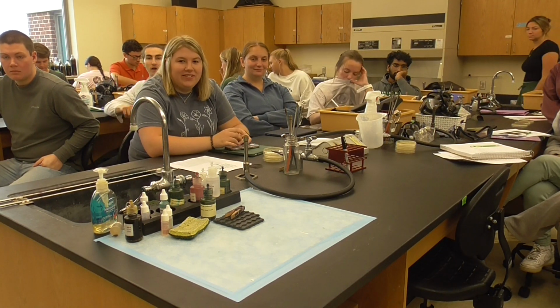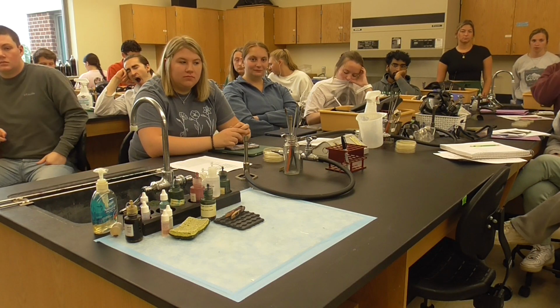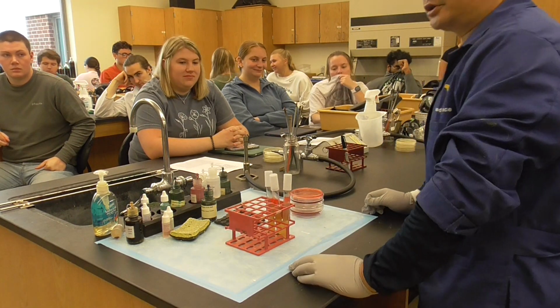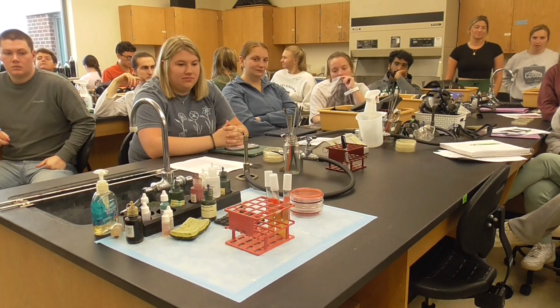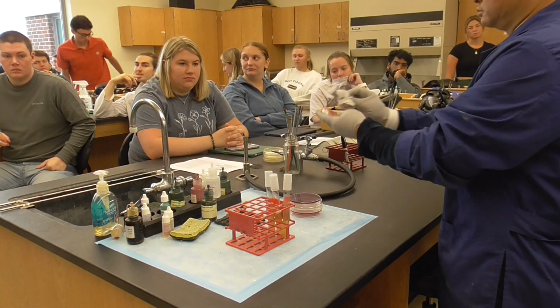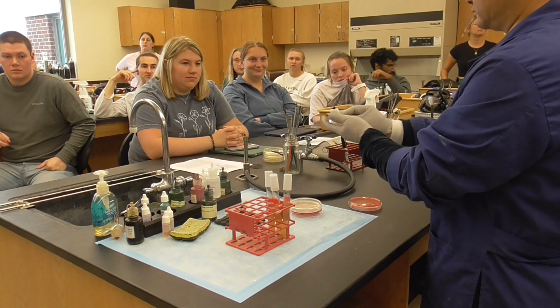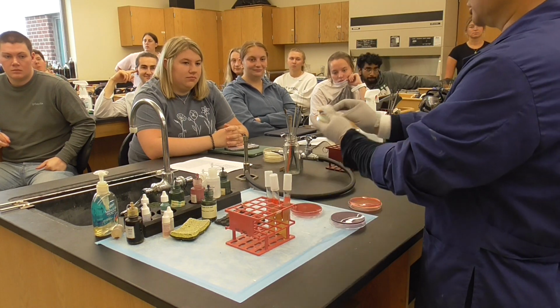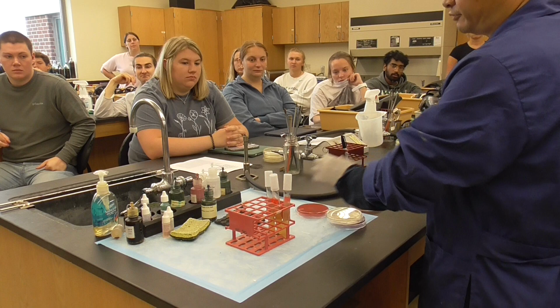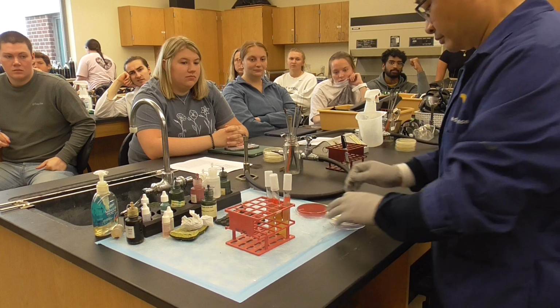Okay, let's have all these agar plates. You put it here, and then go here. First thing first, this is coming from the refrigerator. So what you should do? Dry. Okay, it's coming from the refrigerator. I'm only going to show you guys. I'm not going to do these because it's expensive. Otherwise, I need a full blood agar. That's already $5 each. Okay, this is $1. This is probably like $3 or $5.